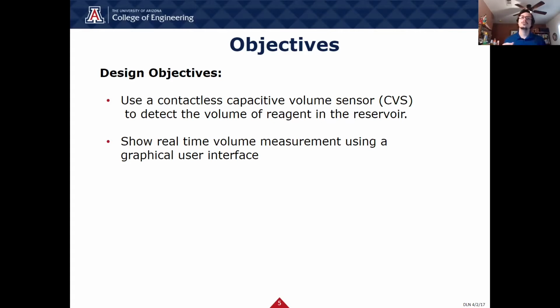So the project aims to achieve a simple, low-cost measuring system of the reagent fluids while maintaining a high degree of precision, accuracy, and resolution. To monitor the fluid level in the reservoir, a graphical user interface will be implemented that displays the current volume measurement in the reservoir. Now to talk about the system requirements, I'll pass it on to Brian.